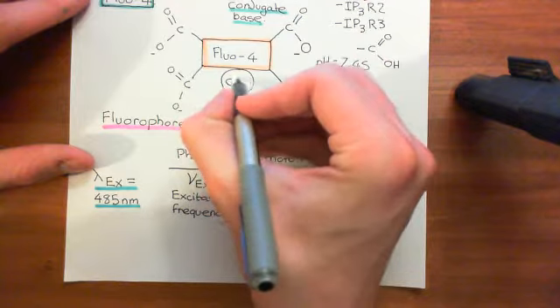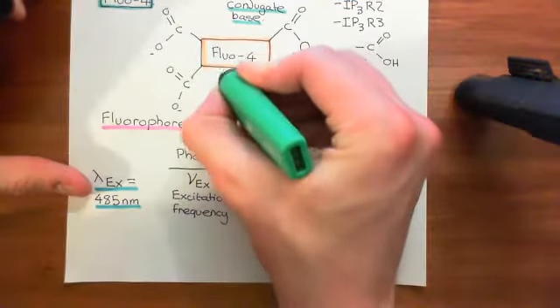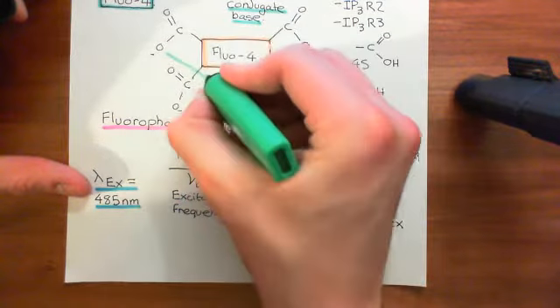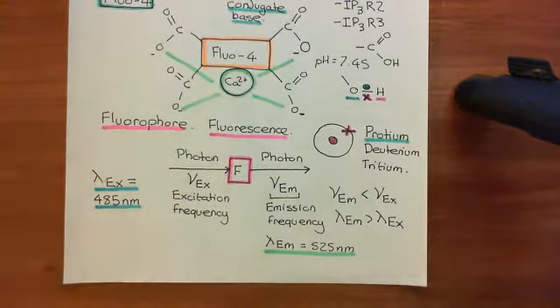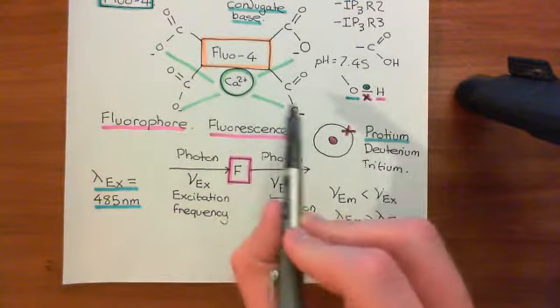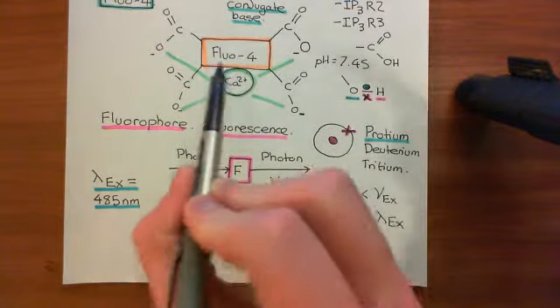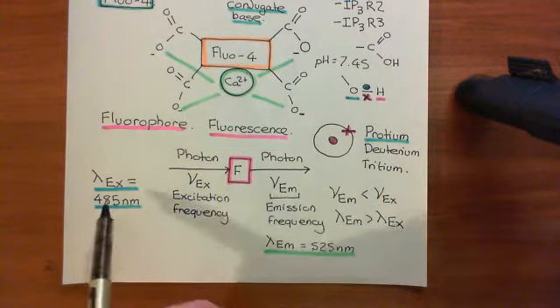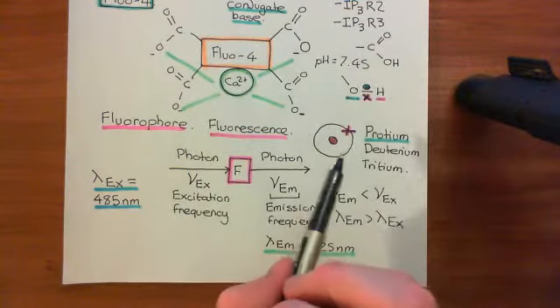Okay, so here's a calcium ion. It has come and bound here, and all of these 4 oxygen atoms with the negative charges are going to interact with this calcium ion, like so. So you're getting these 4 bonds forming. Now, when Fluo-4 does this, it becomes absolutely brilliant at fluorescing. It will now absorb blue light much more readily than before and emit it as green light.